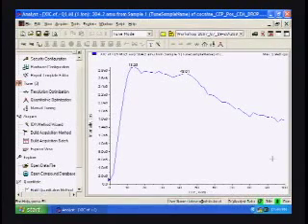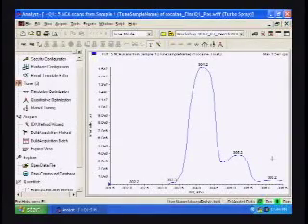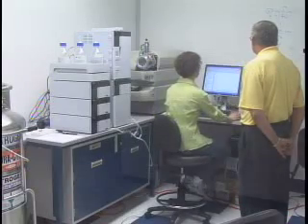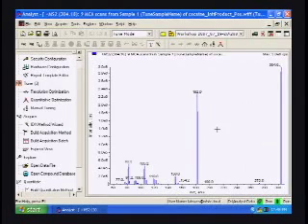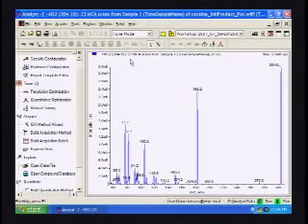One of the functions that the quantitative optimization performs for you is it demonstrates the fragmentation pattern of the analyte during this process. So you get a nice picture of what sort of fragmentation pattern you're getting through your particular compound. In this case, it's cocaine. And so you can see we're getting some good fragmentation even on the low end. It's going to do 26 scans, I think, and add them all together.